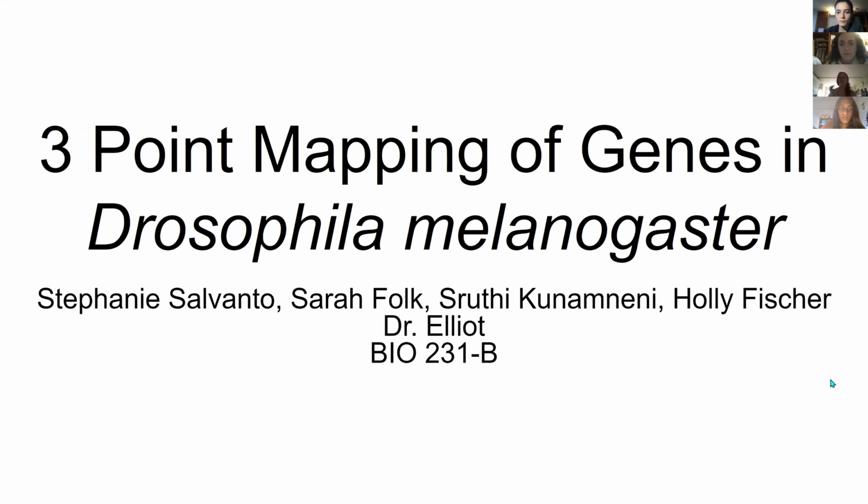3-point mapping of genes in Drosophila melanogaster by Stephanie, Sarah, Shruti, and Holly.